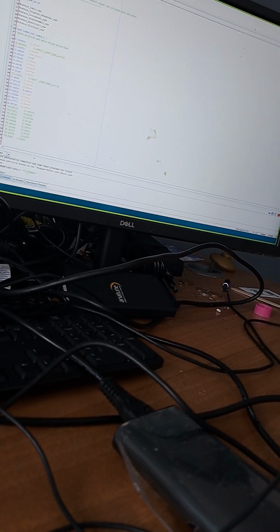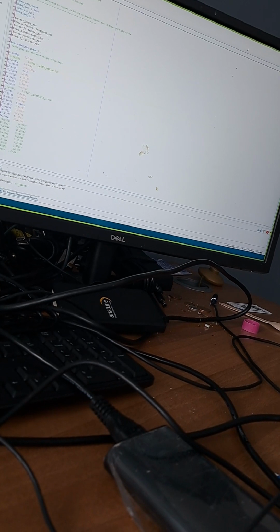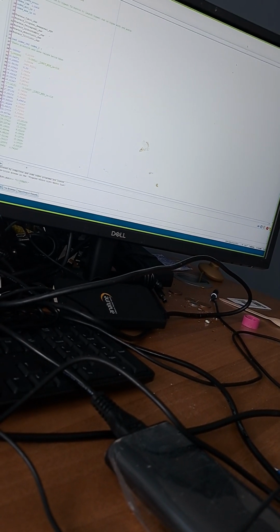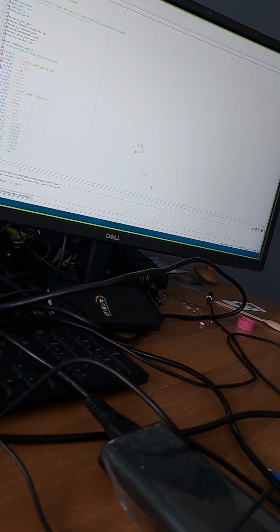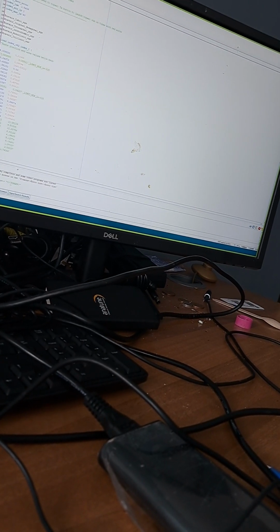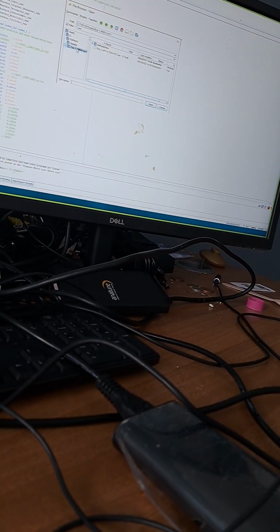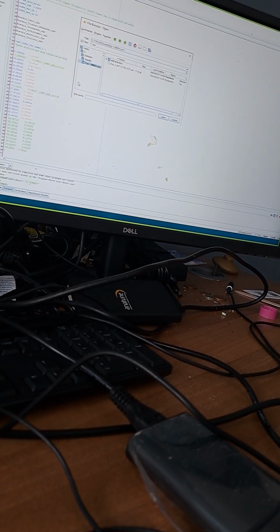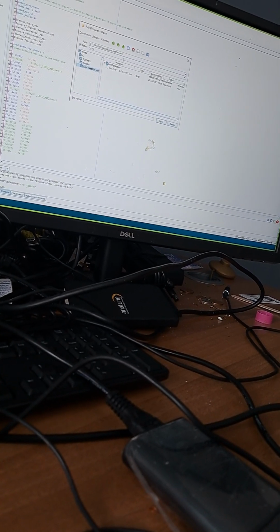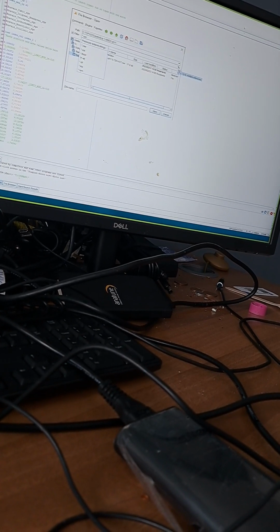So there'll be a new file called whatever it is .ndx, and you want to open that. The filter on the thing says star.raw. That needs to be star. That needs to be the fourth one up.